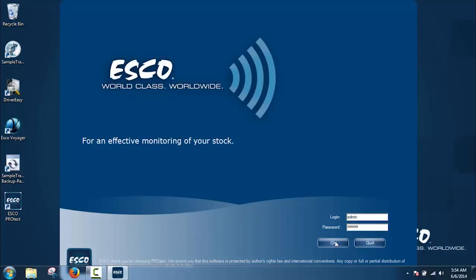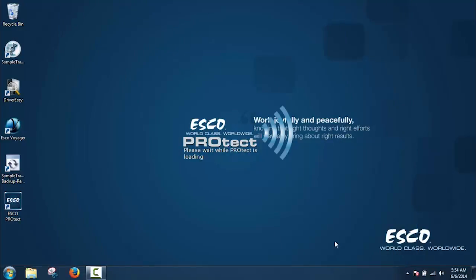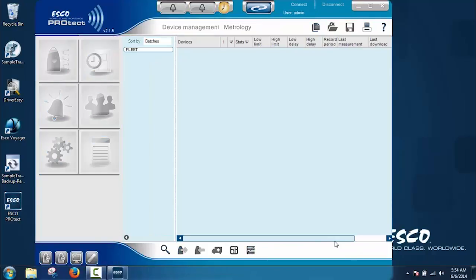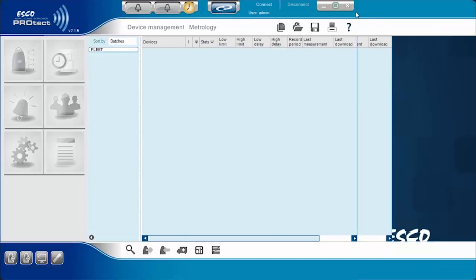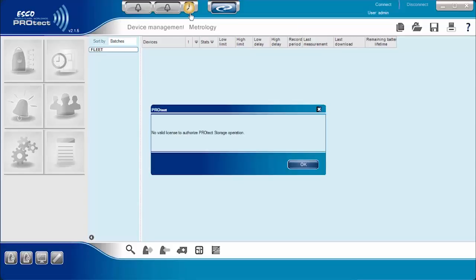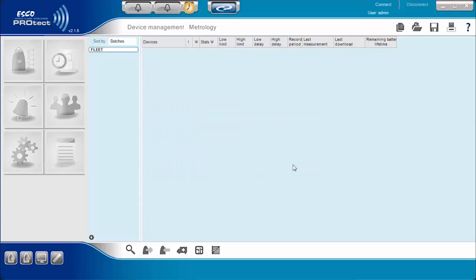Before running the ProTech software, please ensure that the license dongle is plugged into the PC. Otherwise, the software will give an alert that there is no valid license to operate the ProTech software and all menu buttons will be disabled. Once the license dongle is plugged in, the user can now access all menus available on the software.